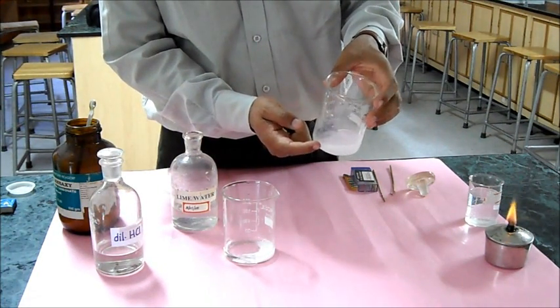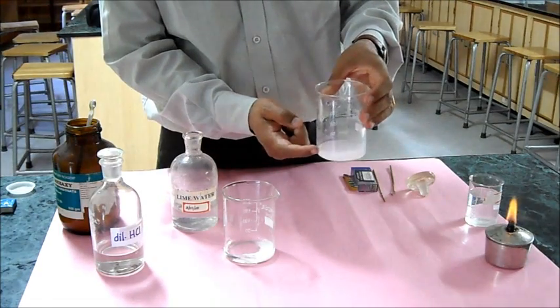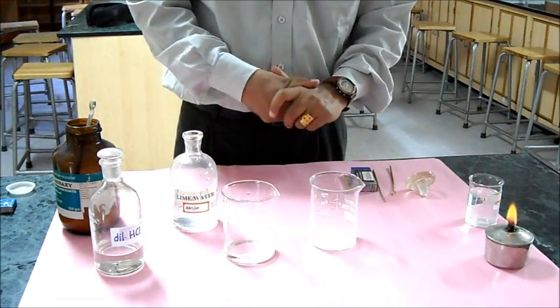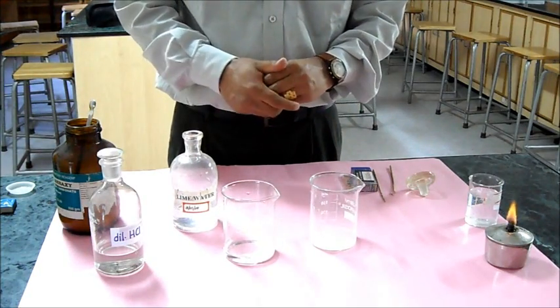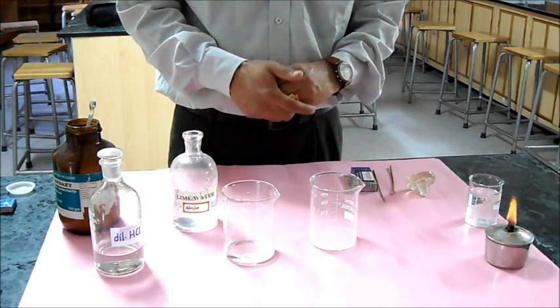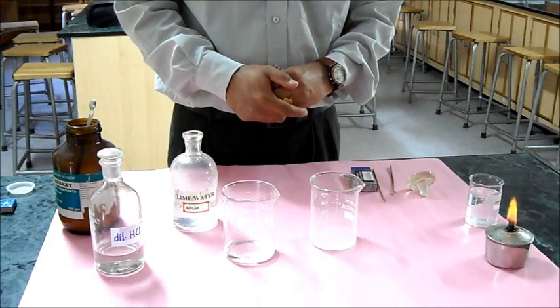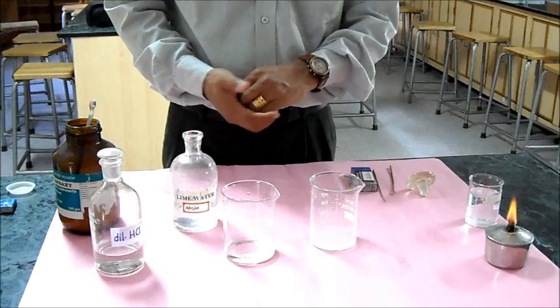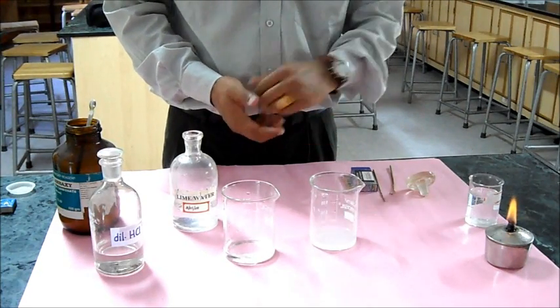This precipitate is nothing but calcium carbonate. This is how we can show the experiment between metal carbonate and acids, and we can verify and test the gas produced during the reaction as carbon dioxide.